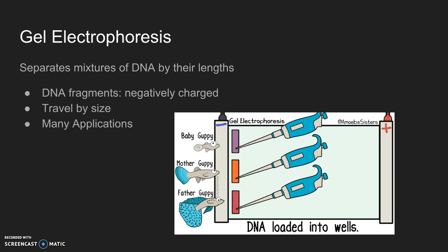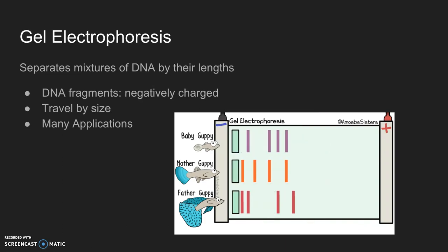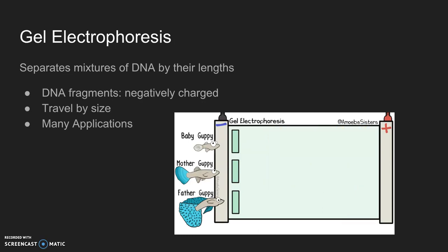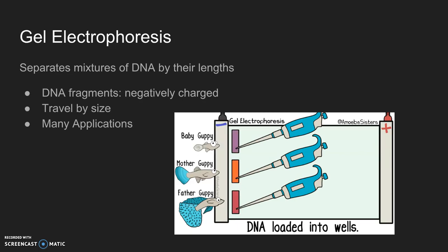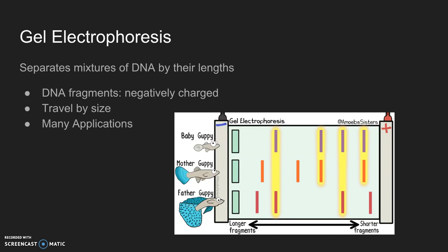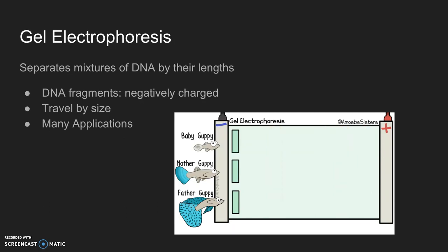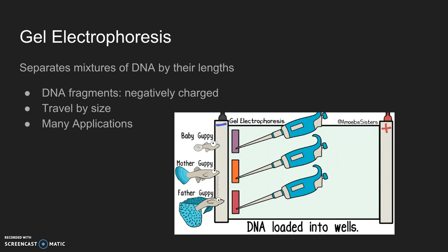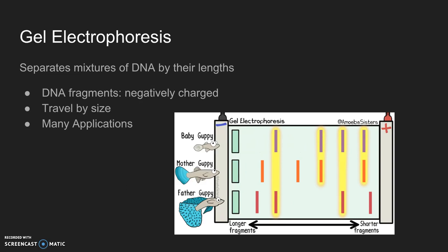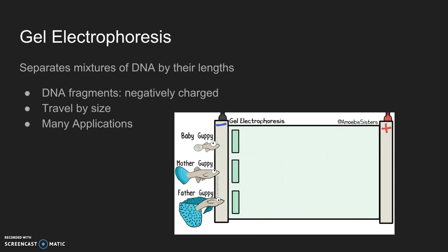When the electrical current is applied, the DNA will be attracted to the positive terminal of the chamber, because by traveling closer to the positive end, the negatively charged DNA reduces the distance and in turn makes the potential energy more negative, by the equation that states potential energy is proportional to the product of 2 charges over the distance.